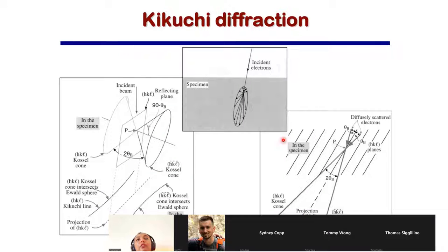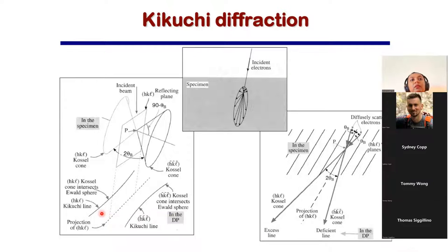Right. Now we talked about Kikuchi. Kikuchi is the thing that you would be seeing every day, because most of the time you would not be at the zone axis. So what is happening here? First, the most important point: in Kikuchi, inelastic diffraction is happening, not elastic diffraction.